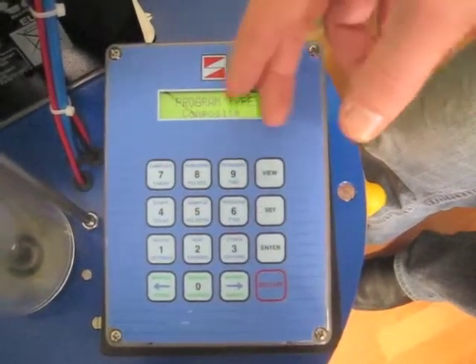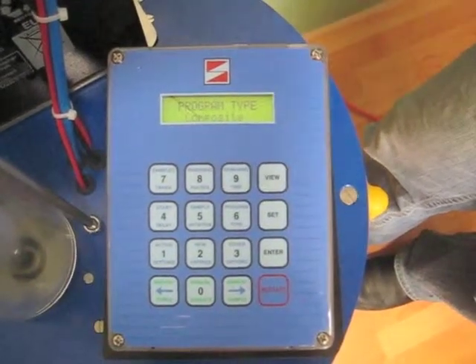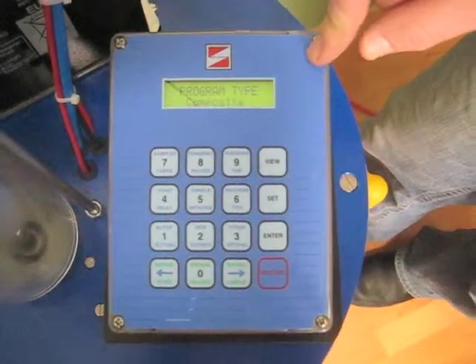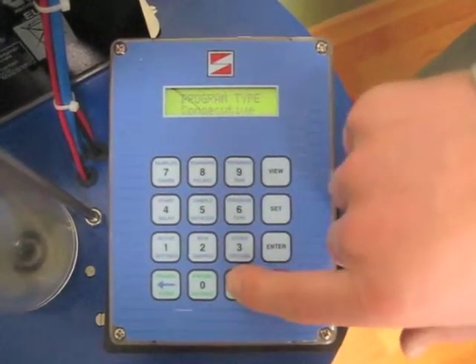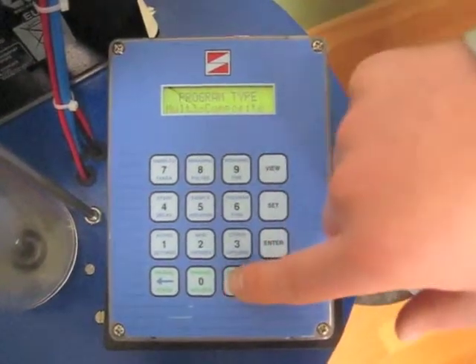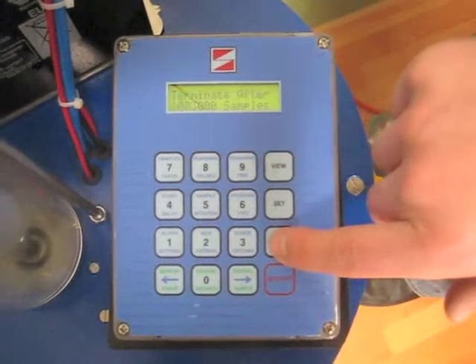Program type is quite straightforward. Do you want composite? In other words, all of the samples in one jug. Or if you have a discrete system with multiple bottles, do you want the sample to go into those different bottles? And that's all we're doing here. You can do consecutive. Multi-composite is something where you're putting multiple samples into one bottle before moving on. Time step. And we'll leave it at composite in this case.